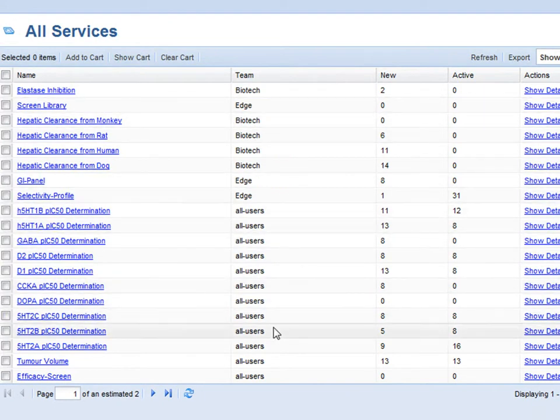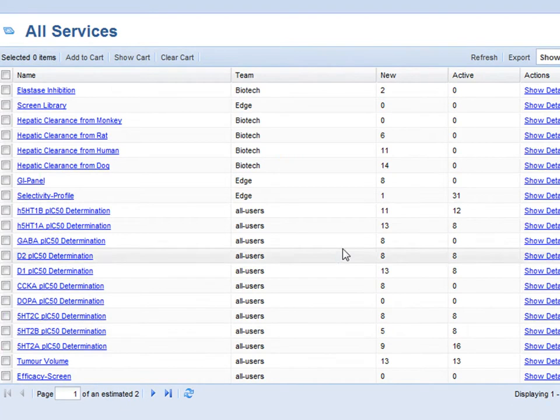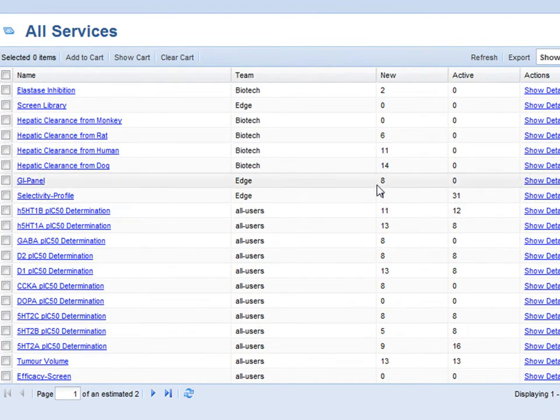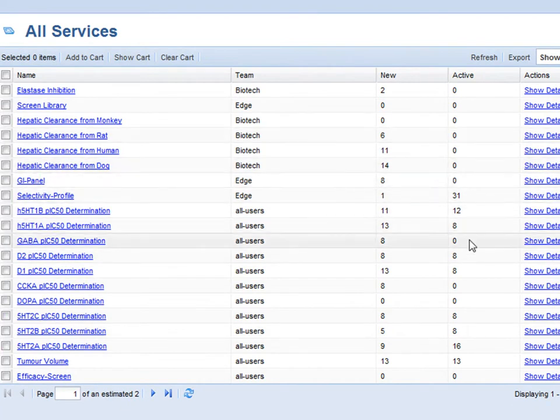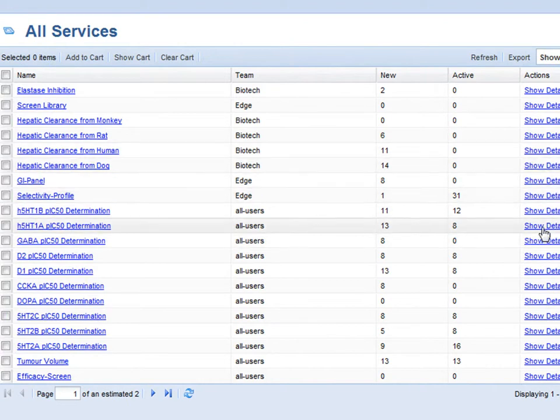I can review the name of the service, which team is running this particular service, any new or active items, and also show details of the service.